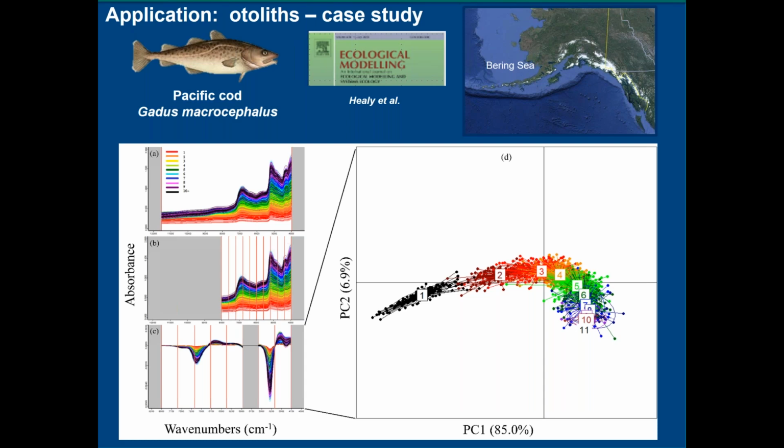As far as cost goes, the cheapest instrument, for instance the Tango, costs roughly, I think, $65,000. And it's a robust instrument. It has expendables that are relatively modest in price, such as new light sources, a new laser, desiccants and that sort of thing. Certainly it would fall within the budget of a typical production aging laboratory. But if you compared, on a case-by-case basis, the instrument versus the amount of money it takes to support an FTE, there's a very large differential there.